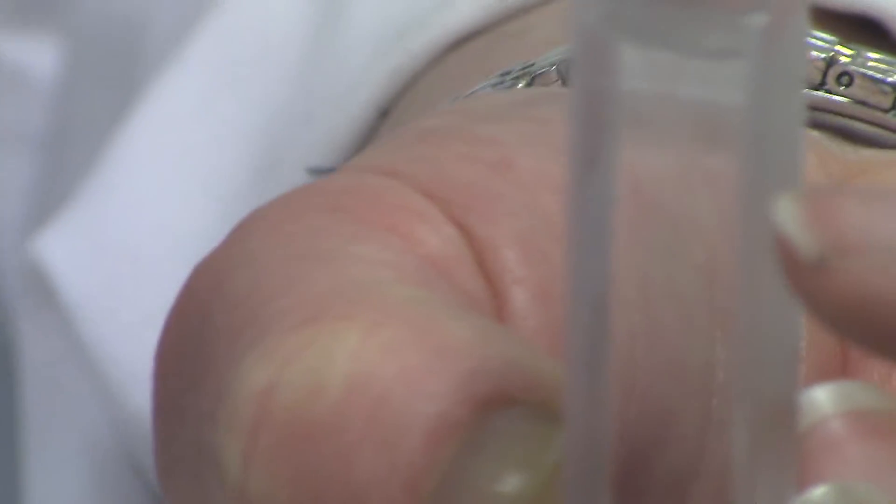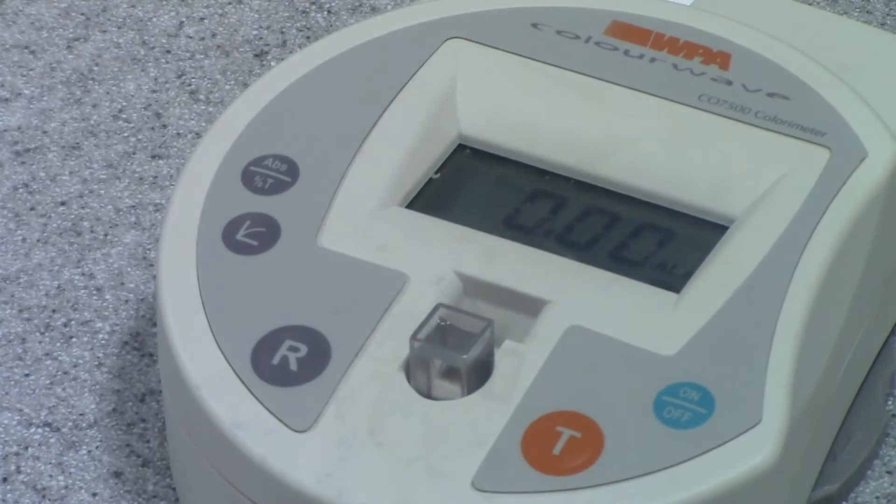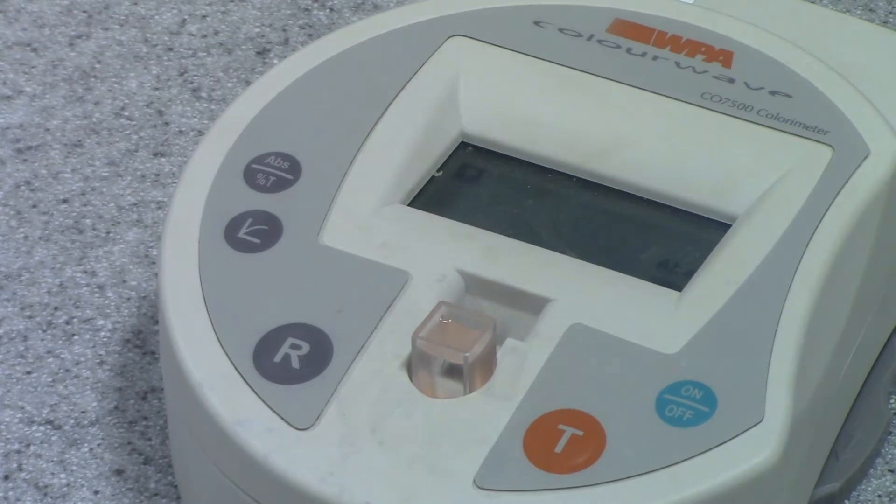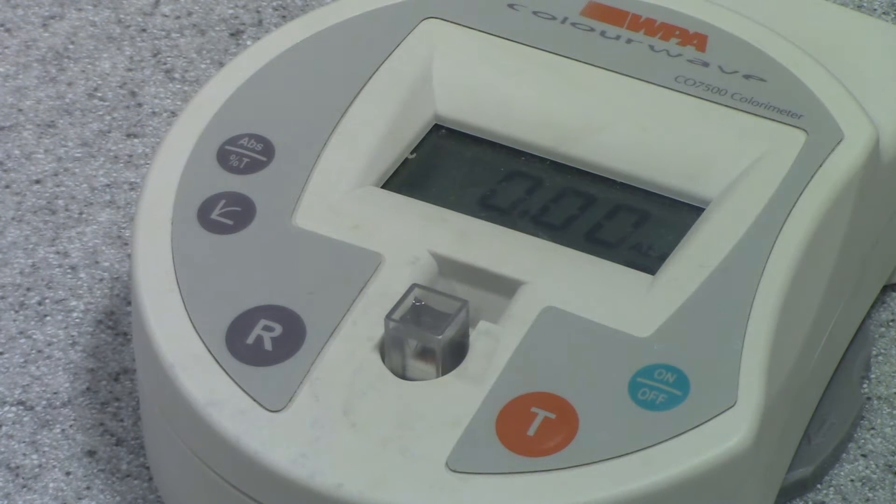There's a little V just on the front of the tube there, and that tells you which way to put it into the machine. So I turn my machine on, I filled it with distilled water, I put my cuvette in and I press R and that should give me a readout of zero because there's no light absorbed because that's distilled water.